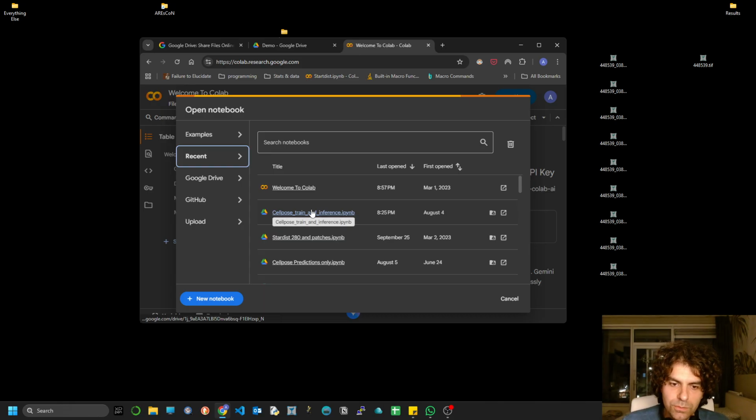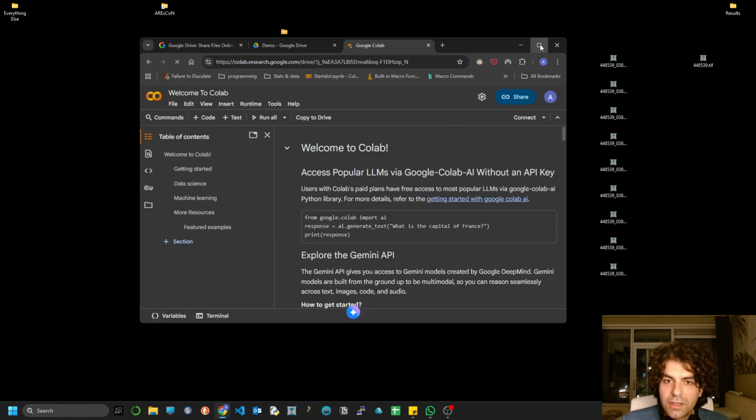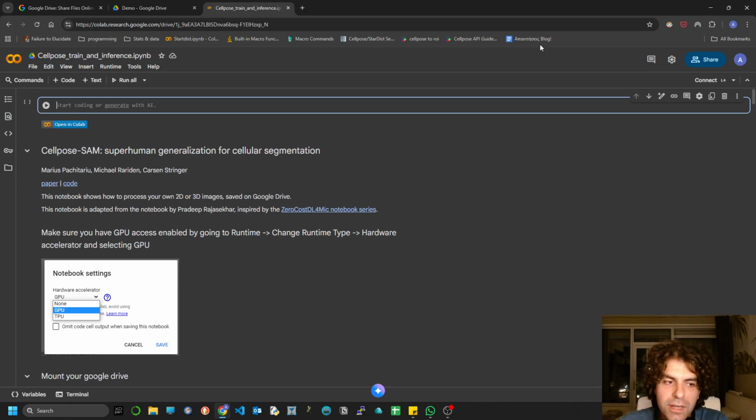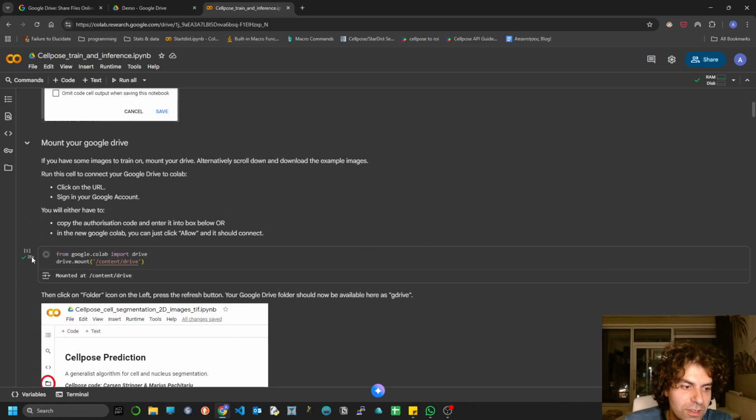I'm going to use this file, which I'm going to provide to you. This is a file that's mostly created by the creators of CellPose, and I have just added some lines, I won't lie, with the help of some generative AI, to proceed to predictions. Anyway, so let's move on.